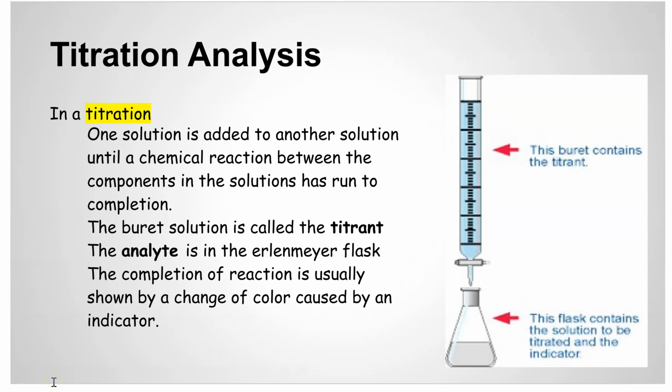In a titration analysis, we have titrant, which is the substance that is in this burette, which allows us to deliver a very precise amount of liquid at a different or variable flow rate. So we can use a stopper, which is located down here, to turn and have the solution enter in a full stream, or we can have the solution enter in a drop-by-drop method.